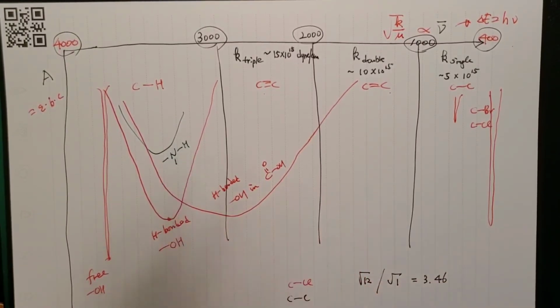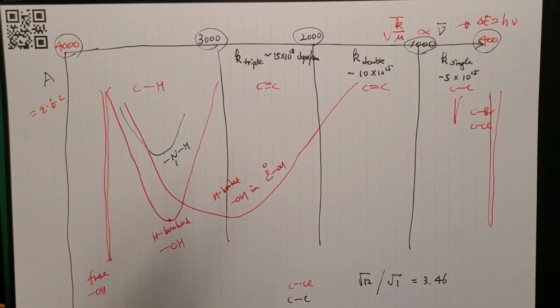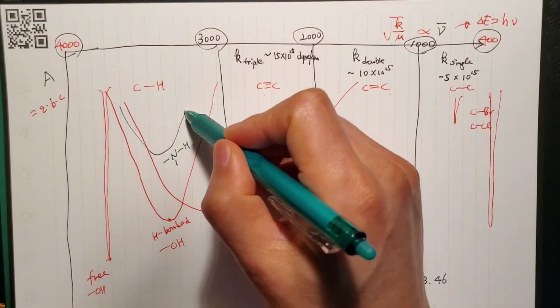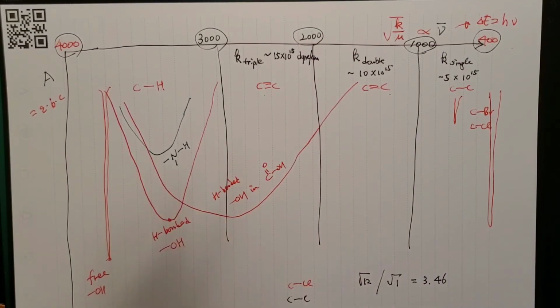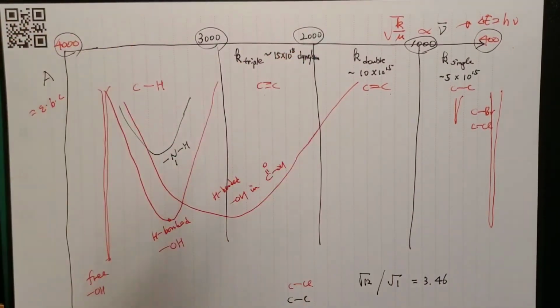The polarity of the NH again can be altered by the environment or the neighboring functional groups, and what conformations you have with the other groups, that changes the molecular dipoles and so on. So I cannot say for sure, but it will be around this location in the middle-ish, but more toward 3000-ish, though not really close.